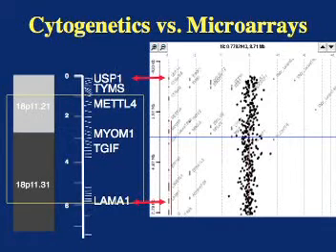The red arrows point to the same genes in each diagram. This way you can see they are aligned. So you can easily see the number of data points that could detect a deletion or duplication and how small such a change could be in comparison to a cytogenetic karyotype. The microarray data shown here is from a low-resolution array. Arrays can be produced with a density of data points that are at a density of more than 20 times what is shown here. This means that we can now detect very small changes in chromosome copy number.